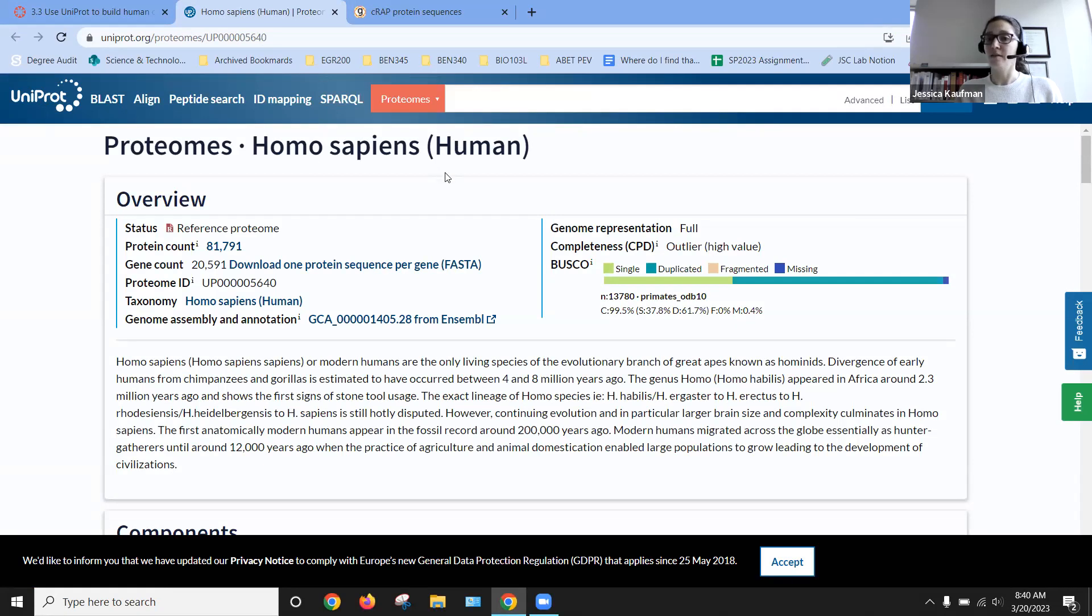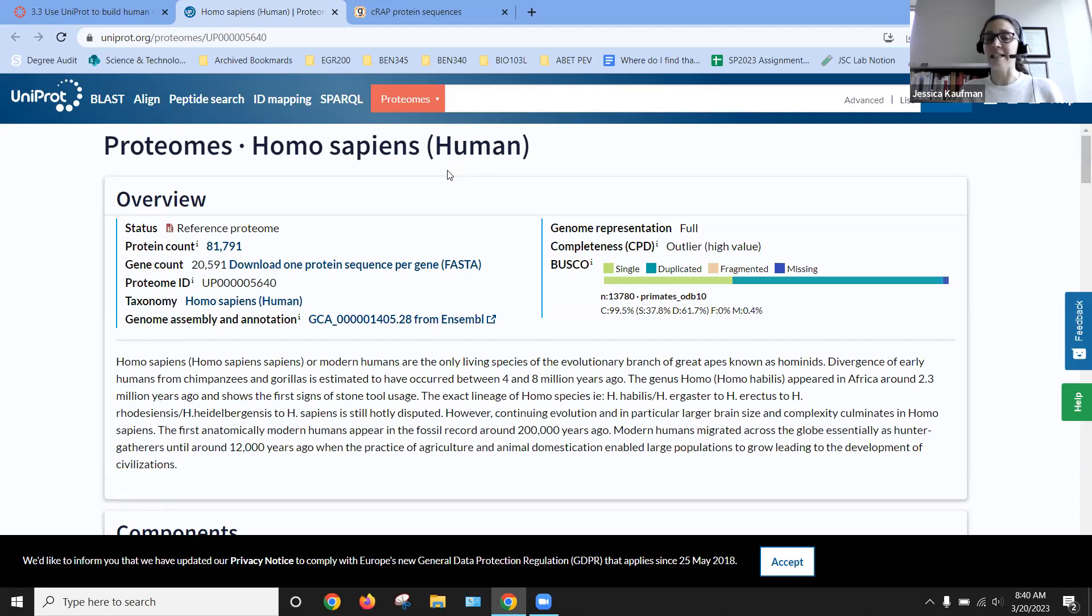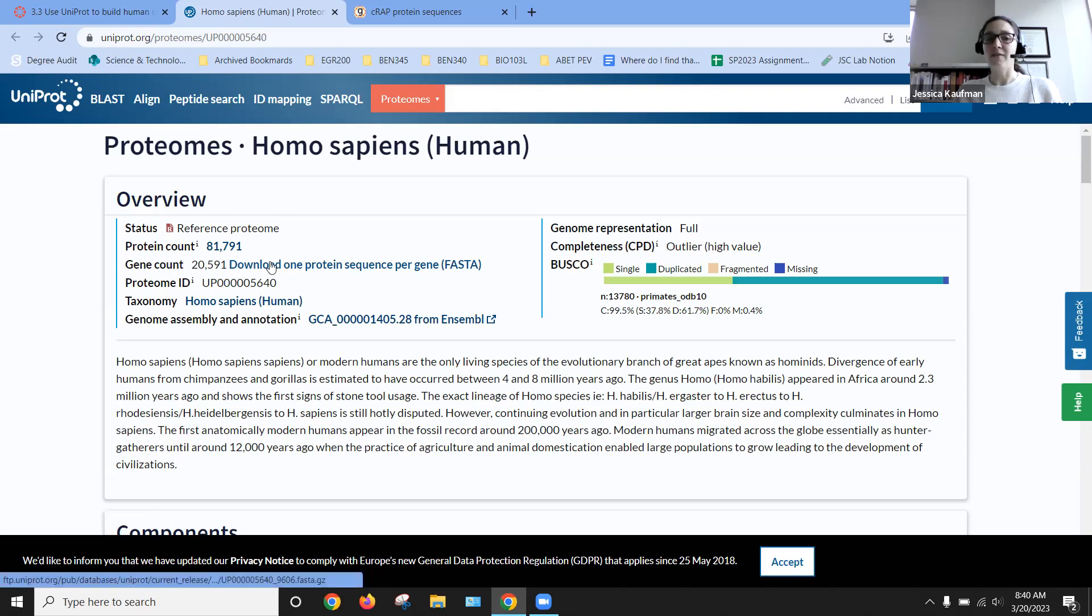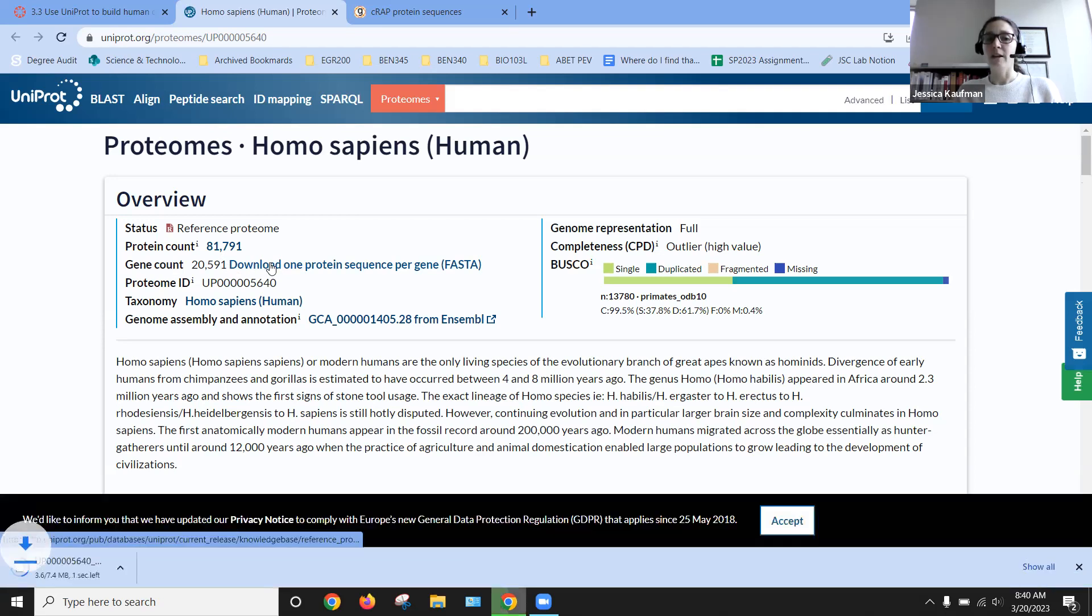One of the proteomes that is first on the list because it's commonly downloaded is the homo sapien proteome. And we can download this file. So you see gene count 20,591.